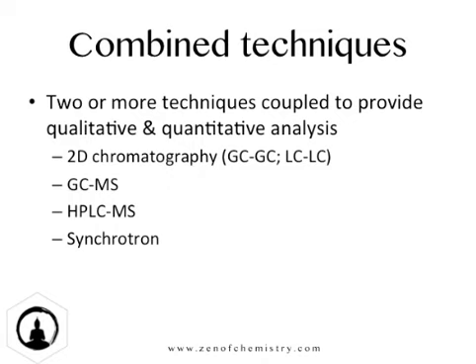But for the purposes of this video, I really want to focus on the idea that you can use IR, NMR, and mass spec. They're three different techniques that you can use together to get results from each separately, to then pull your information together to find out the qualitative nature of your molecule.